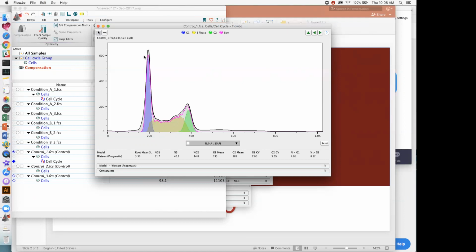In the case that you cannot identify the G1 phase, there are drugs like mimosine that inhibit DNA synthesis at the very beginning, and therefore will lock the cells at the start, so you'll see a very nice peak for the G1 stage of the cell cycle. So I would encourage you, if you are using primary cells, to use L-mimosine and colchicine for your G1 and G2 controls. If you're using cell lines, normally you can get away with simply a random cycling population of cells like we have in this case.